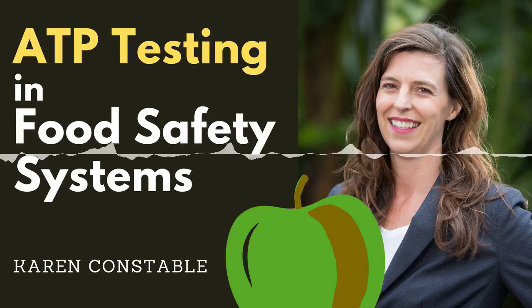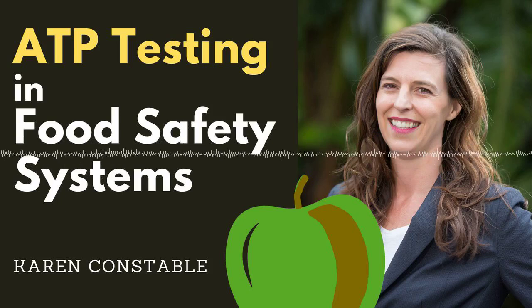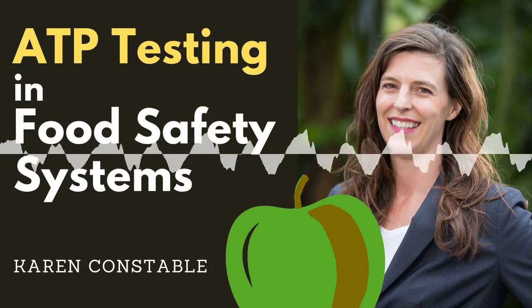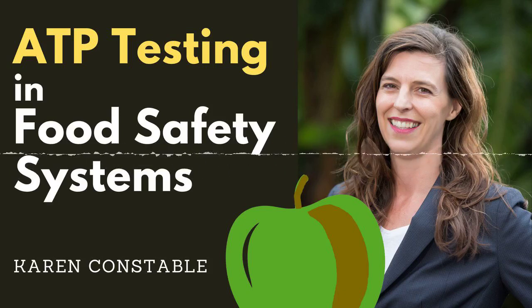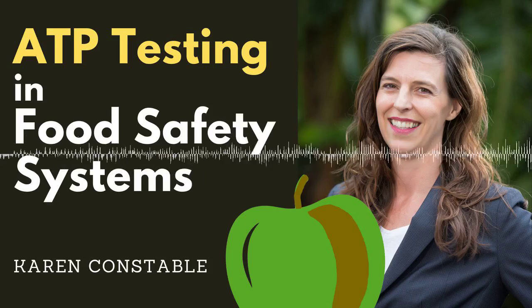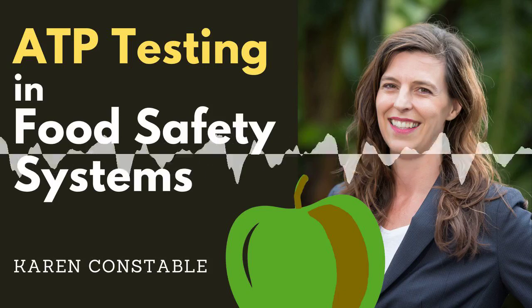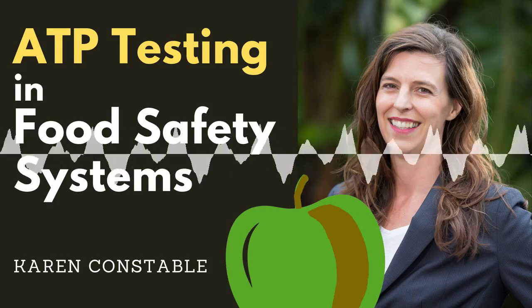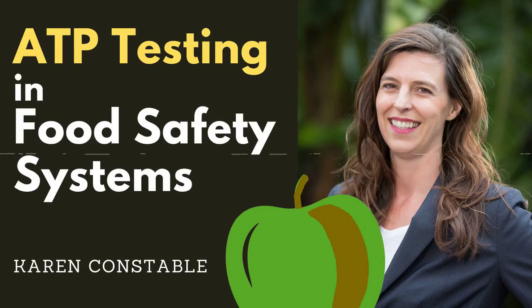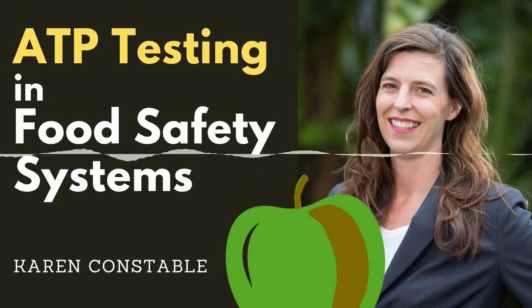$1,500 to $3,500. Sometimes the luminometer purchase includes swabs, which increases the cost. Swabs usually come in a case of 100 swabs and range in cost from about $225 to $360 per case. The enzyme solutions that are part of the swab will expire. This is important to consider when purchasing swabs. Additional materials include calibration kits, positive controls, and carrying cases.